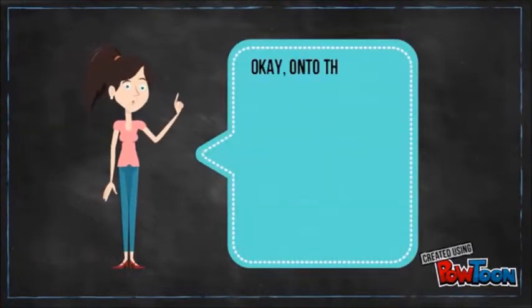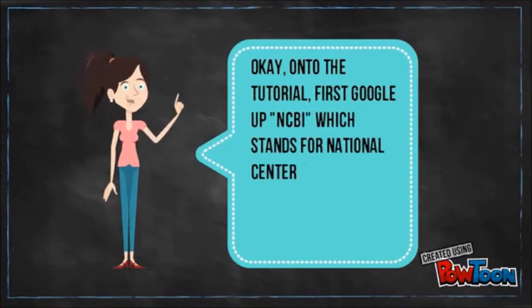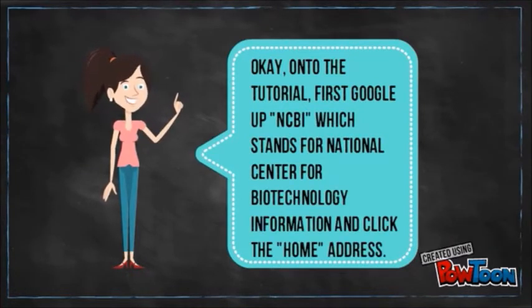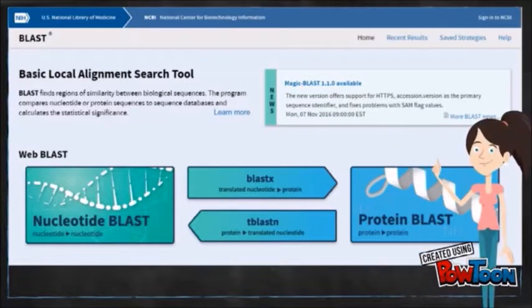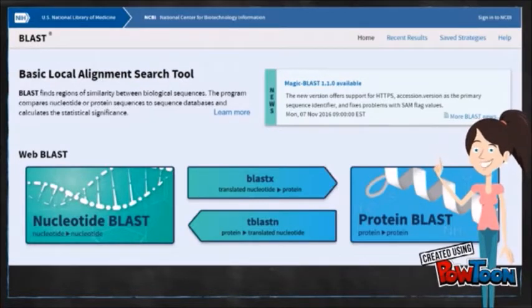So, any query? Okay, on to the tutorial. First, Google NCBI which stands for National Center for Biotechnology Information and click the home address. Here we're going to see there are 4 types of BLAST consisting of BLAST P, BLAST X, BLAST N and lastly BLAST N. The latter is the one we are going to have tutorial on.